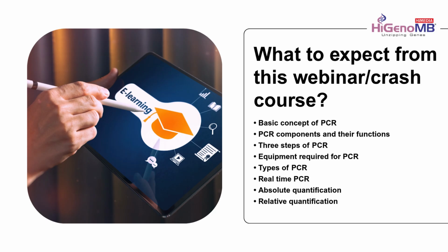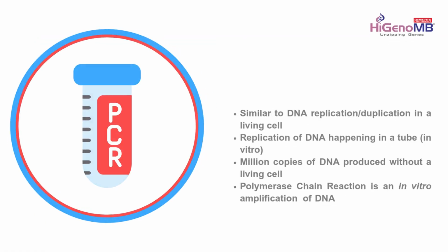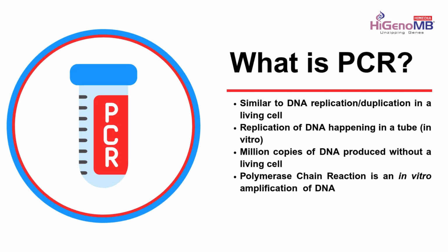Okay, so we understood that many of our participants are from a bachelor degree background, so to cover the basics, there will be lots of basic concepts covered here, so that at the end of the session you will be clear about the concepts of PCR, the components used in PCR, and the reason why we are using all of this.